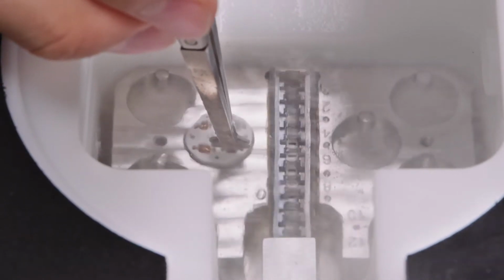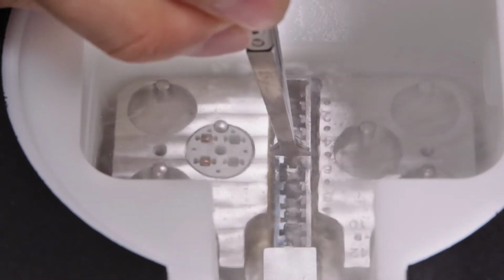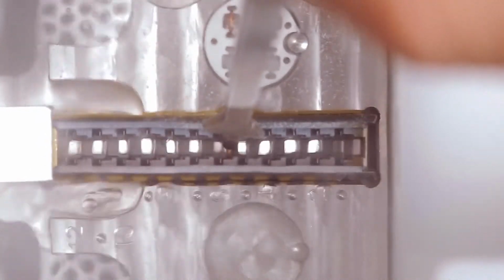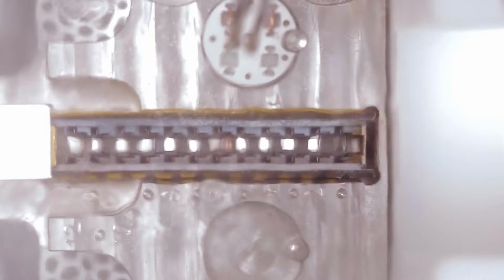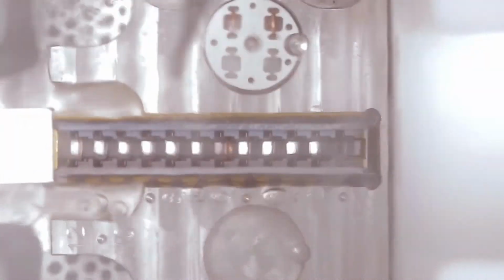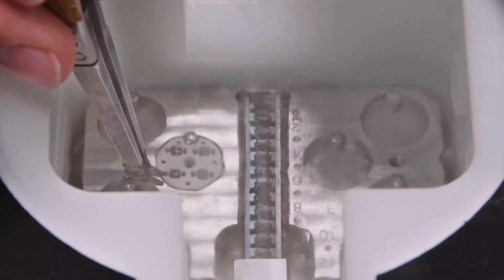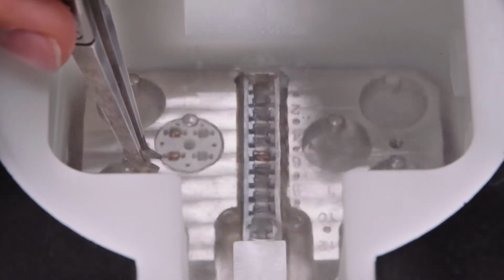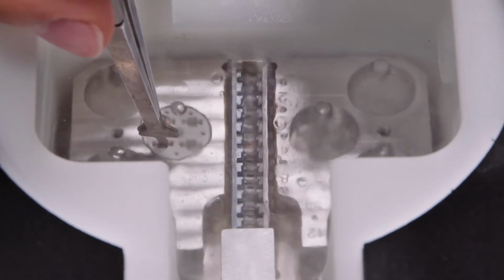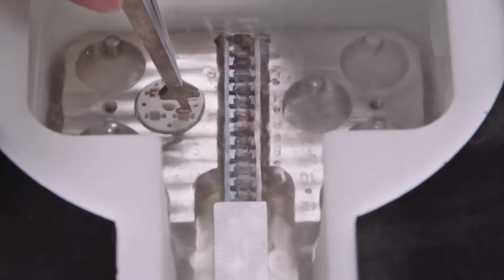So we can now start loading our grids into the cassette with the tweezers straight. So that's one. And we turn it around and we tap it. Now a lot of the view will be obscured by the nitrogen vapor. So it's good that when you first work with an autoloader cassette and the cartridges, you first practice this by hand, because a lot of this you'll do by feeling, because some of the clarity in your vision will be obscured by the vapor of the nitrogen.